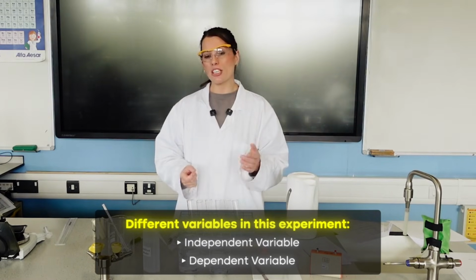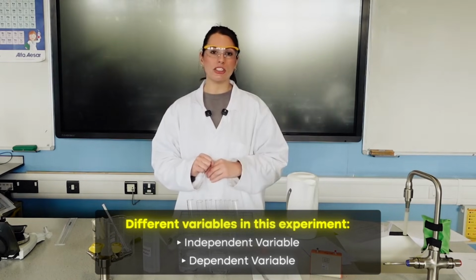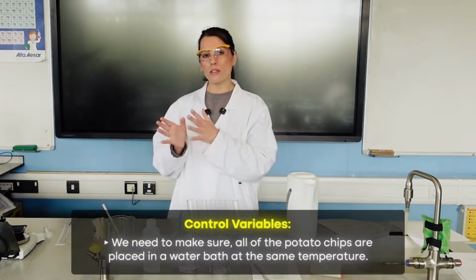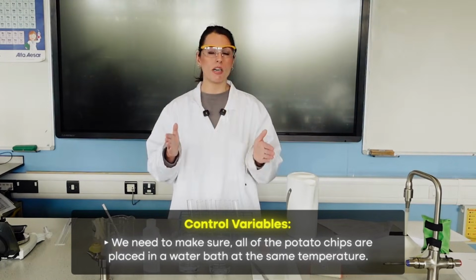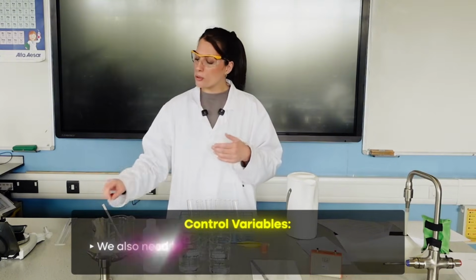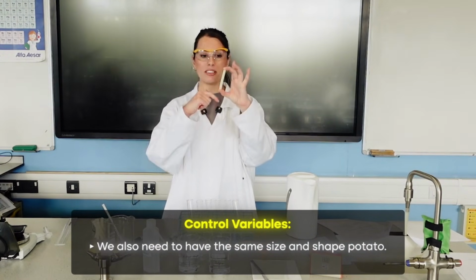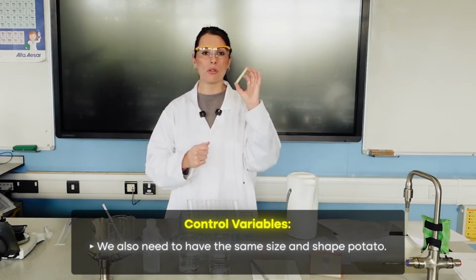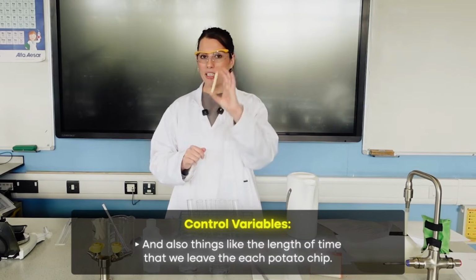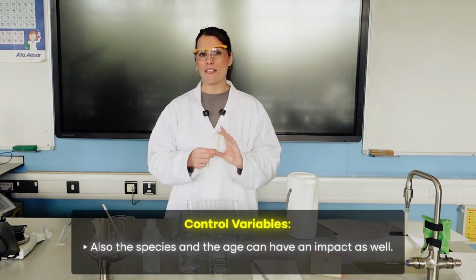The dependent variable is going to be our percentage change in mass. So we will need to measure the initial mass, the final mass, and then work that out as a percentage change in mass. And then our control variables: we will need to make sure that all of the potato chips are placed in a water bath at the same temperature because temperature affects the rate of osmosis. We also need to have the same size and shape potato because the surface area to volume ratio will also affect the rate of osmosis. And also things like the length of time that we leave each potato chip. Also the species and the age can have an impact as well.